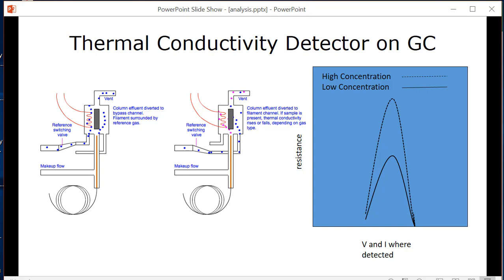And you might just say, well, why don't we just use these points? Because then I could just use ratios, right? And that would make sense. If I have a set concentration at this voltage or resistance and a set concentration at this greater amount of ohms, then you have a relationship that will basically tell you how the ohms varies with concentration. The problem with that is there's other effects as things get very concentrated where the molecules themselves start to interact with each other. So consequently, the trend breaks linearity, or if you get to very low concentrations, the instrument parameters might change. Long story short, the traditional way you do it is you just analyze concentrations over and bracket the concentrations where your unknown is found.